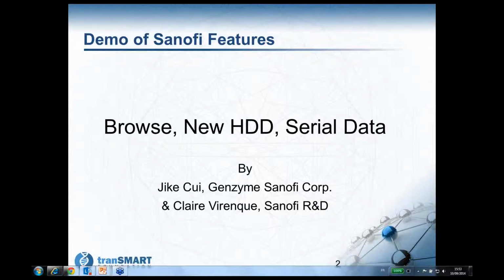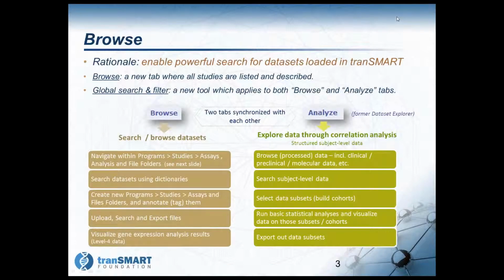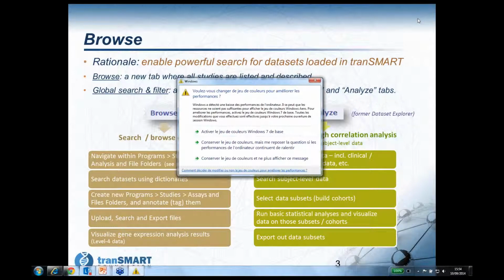So it's my pleasure to give you an overview of the features that we have developed at Sanofi over the past 2 years and which are now available in this new 1.2 release of tranSMART. So my time being limited, I will focus my presentation and demo on the major announcements only, which should be of highest interest for you, I hope. So I will first present a few slides just to introduce those announcements, even if UK already gave some words about it previously.